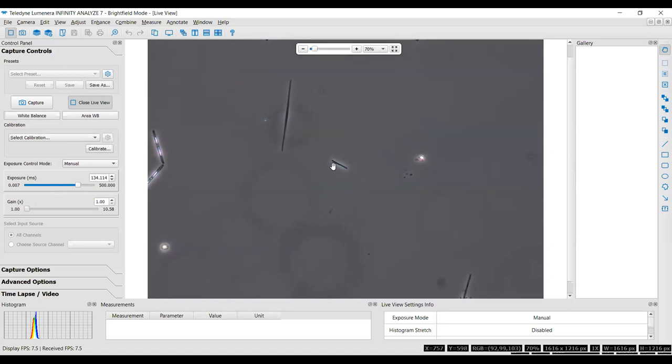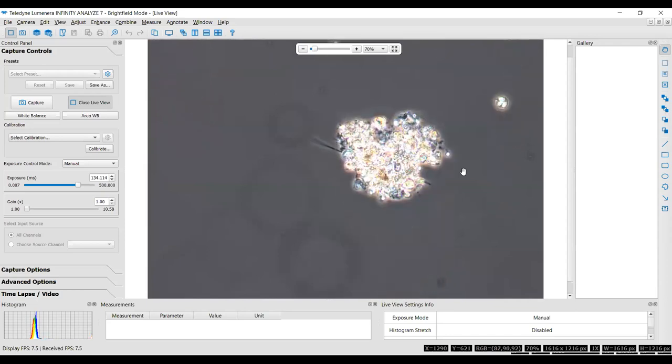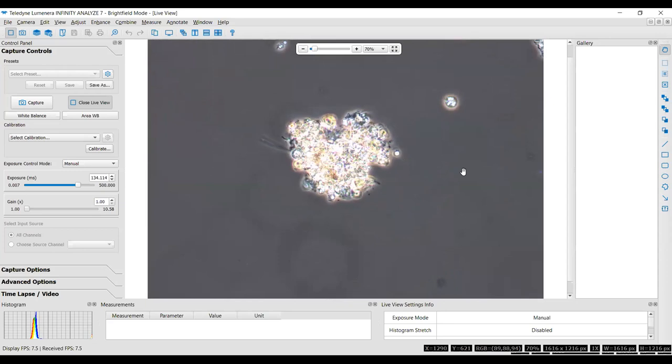So one thing that we didn't talk a lot about, but you've heard me mention, is GALD. That's the longest distance you can measure this thing. So here, it's here to here. And on the stellate one, which I just got rid of, it would have been from tip to tip. And then you have this kind of stuff happen. And this particular sample actually is in the Gram's iodine.